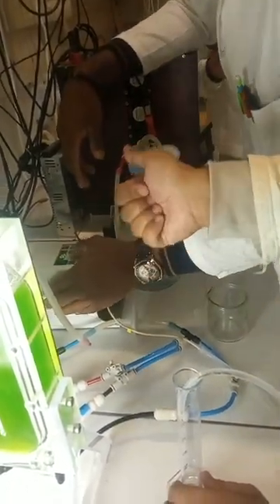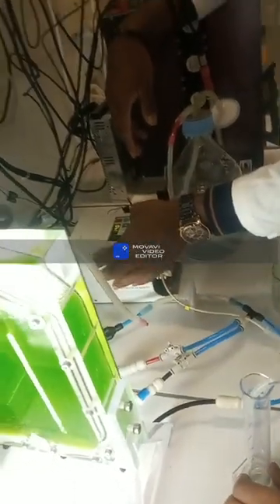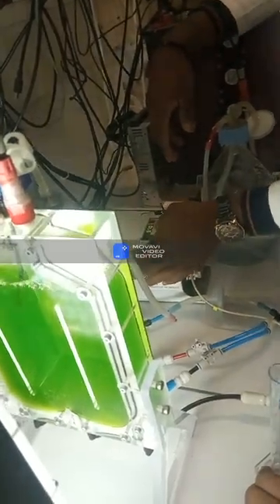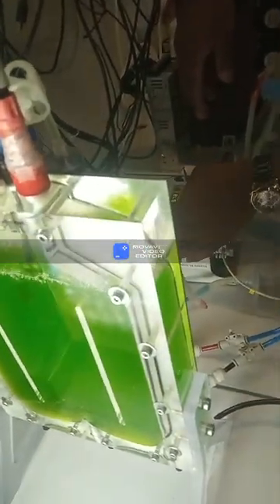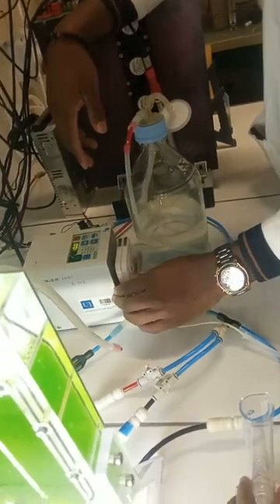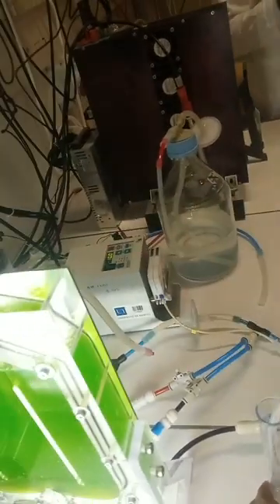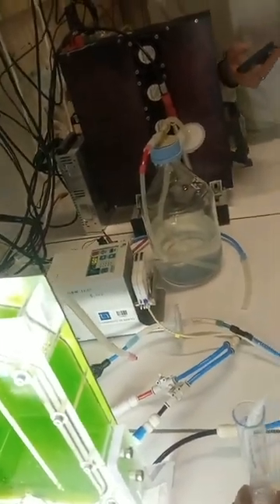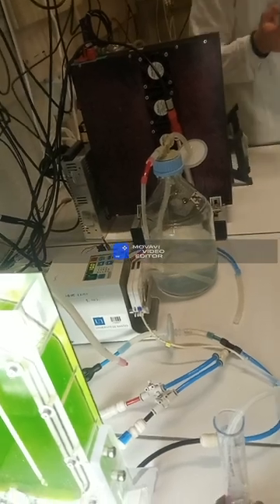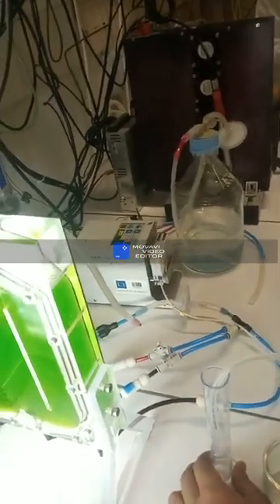When increasing the maximum, we will start this. That's weird. Just 2, 3. You succeeded. 10. Now it is okay.